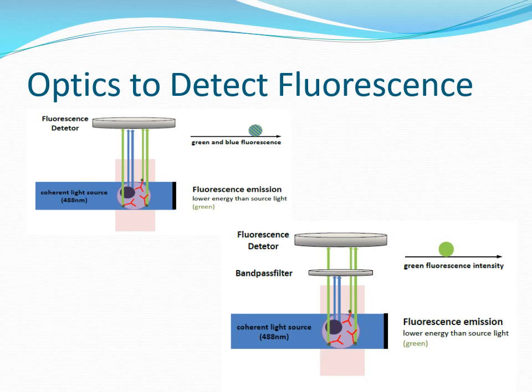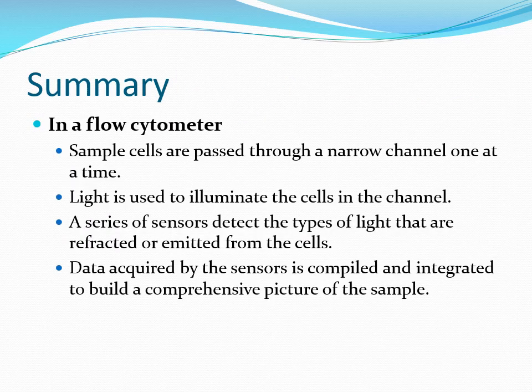Now up to 17 different compatible fluorophores can be used in parallel in the modern systems of flow cytometry. The only thing is that specific band pass filters are to be used along with the detectors to detect this fluorescence, so that these different peaks of different fluorophores do not interfere with each other, and we get a clear picture of the cells that are under study.